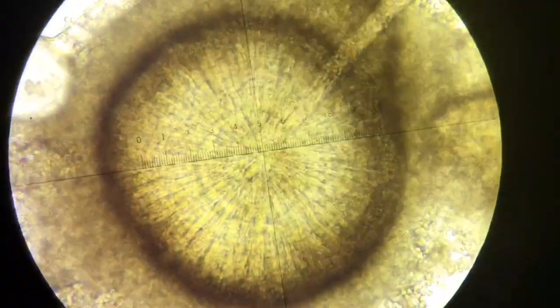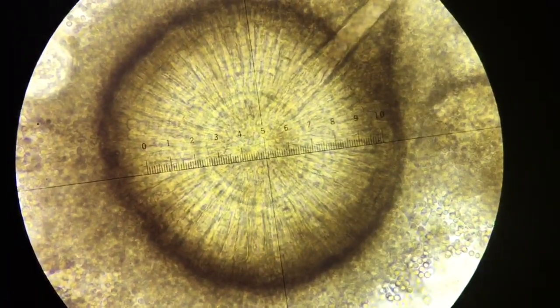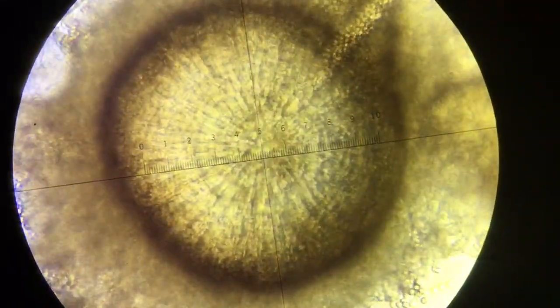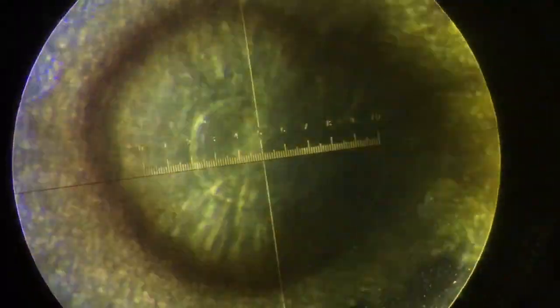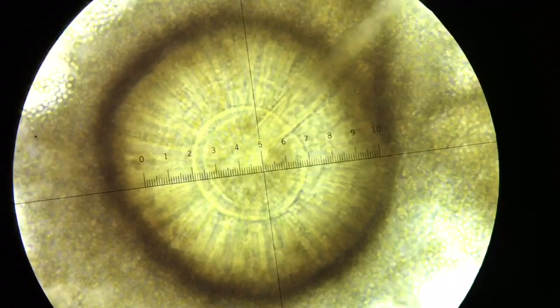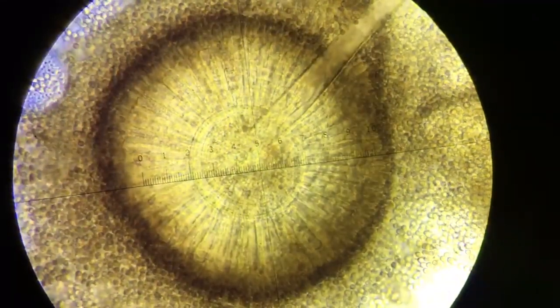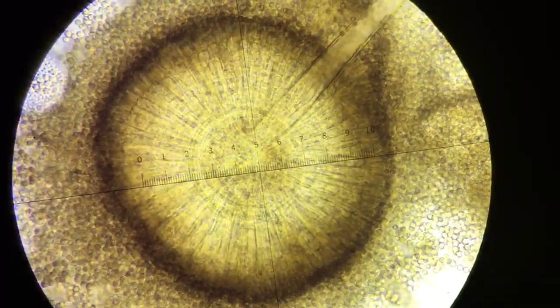These structures are producing spores that are not bound in a membrane, so you get the irregular margins where just chains of conidia are being produced with no boundaries.